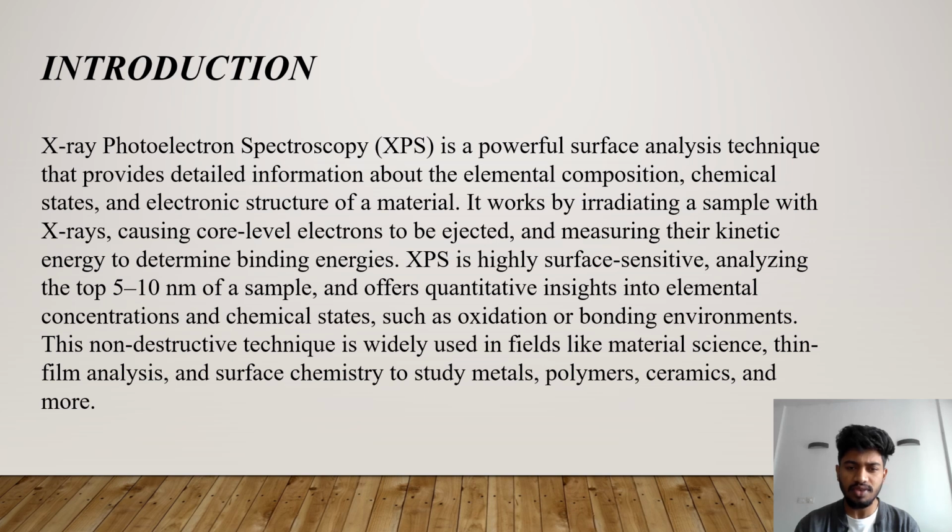XPS is highly surface sensitive, analyzing the top 5 to 10 nanometers of a sample, and offers quantitative insights into elemental concentrations and chemical states, such as oxidation or bonding environment. This non-destructive technique is widely used in fields like material science, thin film analysis, and surface chemistry to study metals, polymers, ceramics, and many more.